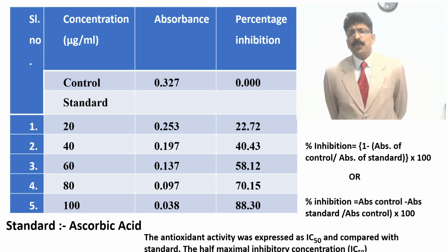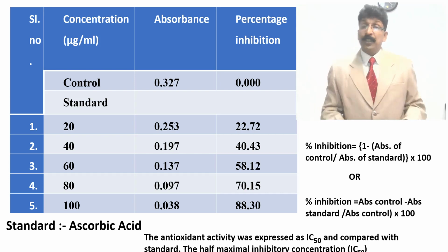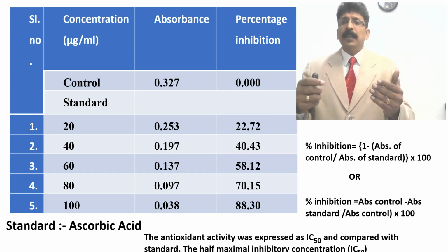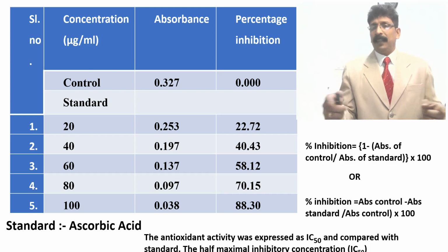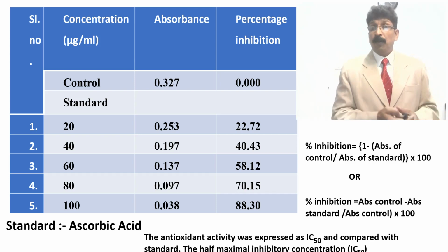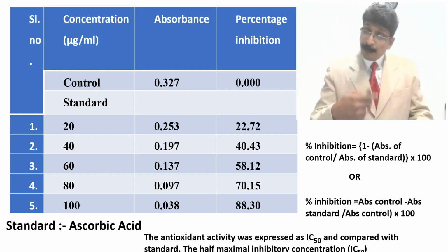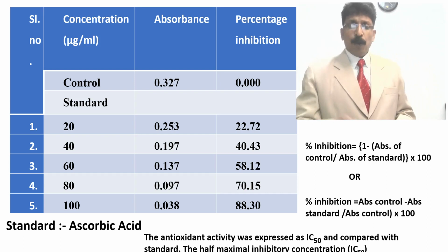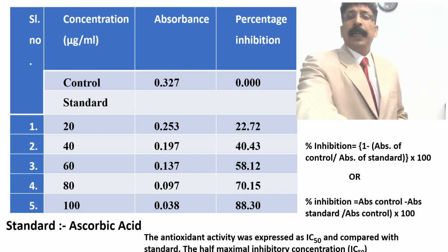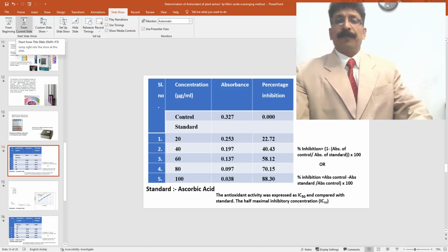So I want to show you this Excel, how to do it. Very, very simple. I hope the last experiment which I explained was not well clear. When I saw it, I had left a bracket in the Excel so that it gave a lower value of IC50. So now the students can clear the doubt and experiment on their own laptops, doing their own Excel calculation. So let me go to the Excel and show you how to calculate now. It will be easy for you.